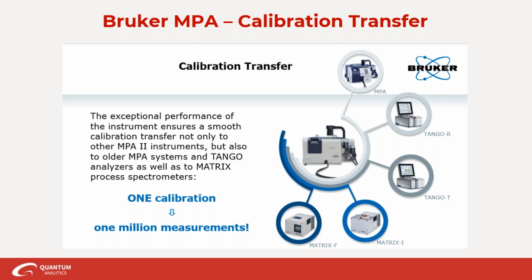In the past, I worked with AOTF instruments, which used a vibrating crystal to diffract the light. So, they had some cool advantages, but one problem with them was you can't reproduce a crystal. So you couldn't reproduce the instrument. So you build a calibration on one instrument. It may not work on another instrument. There were some things you could do to try to make it work. Sometimes it worked, sometimes it didn't, but you had to put a lot of labor intensive stuff into that.